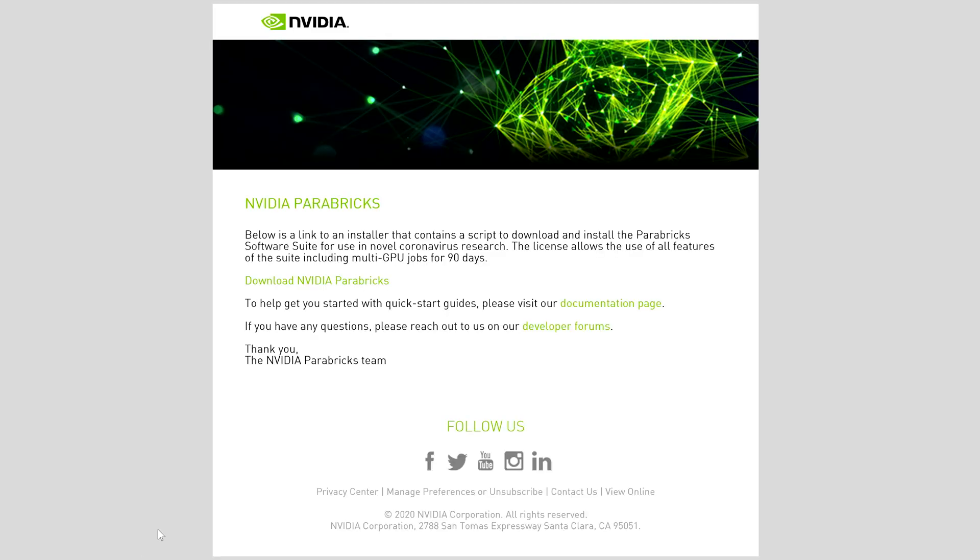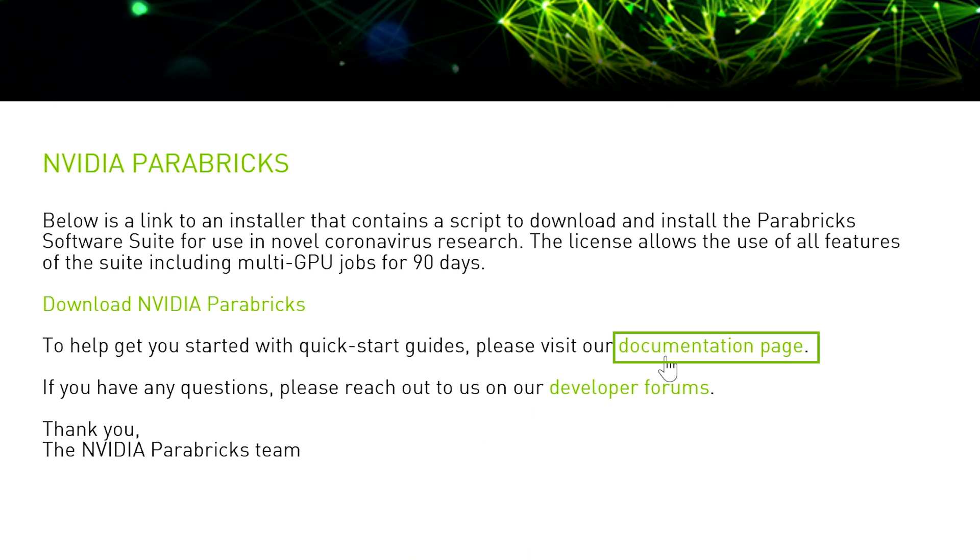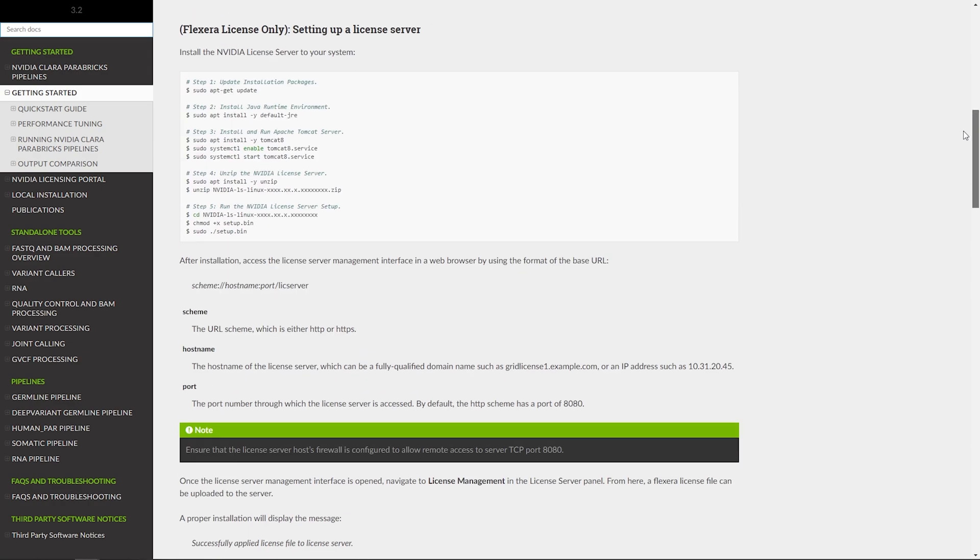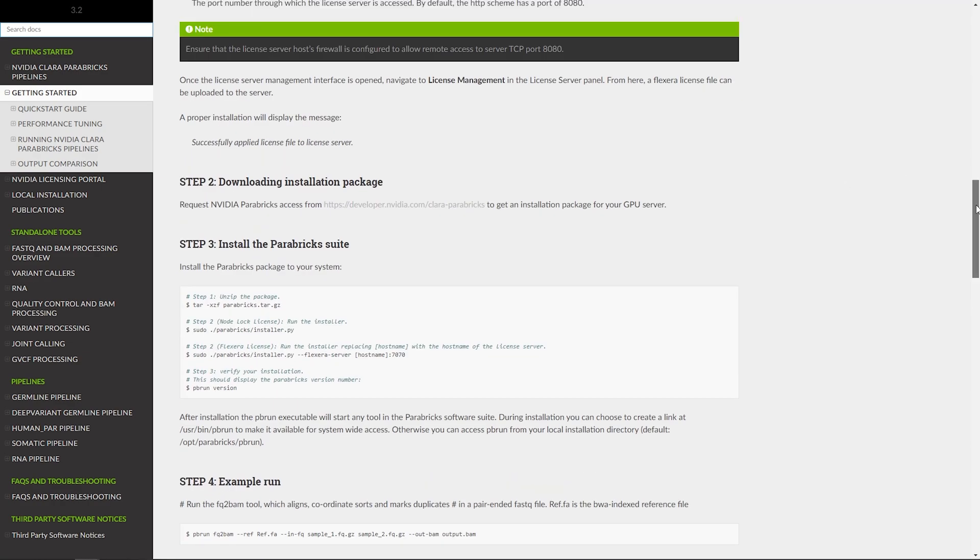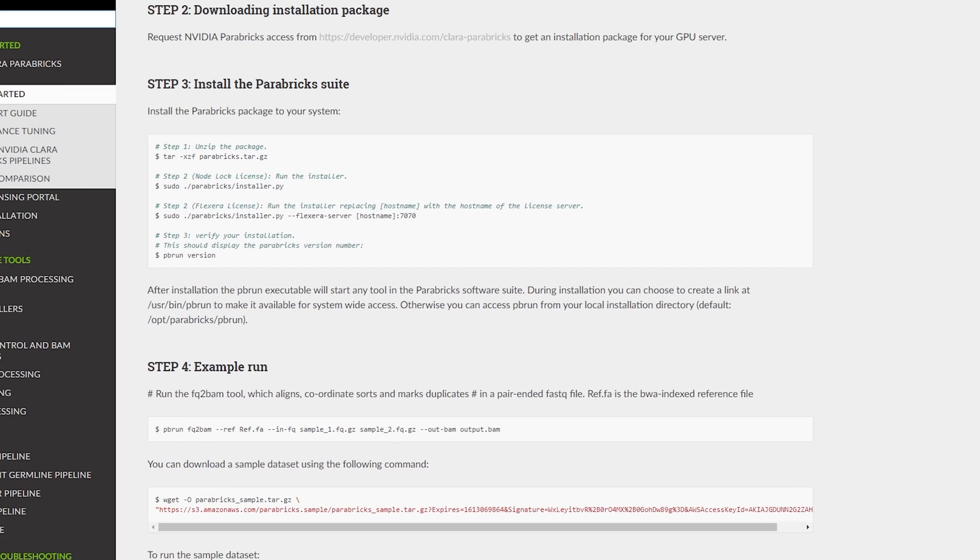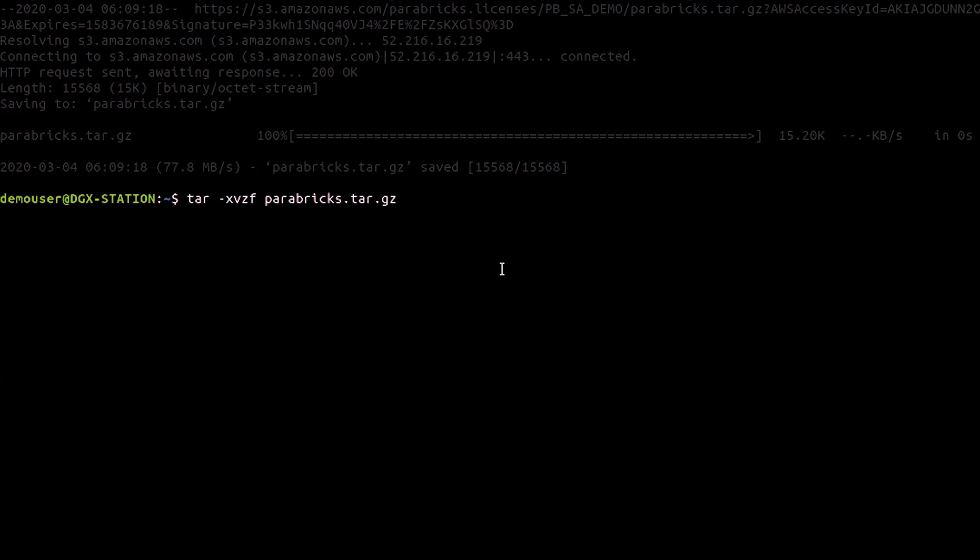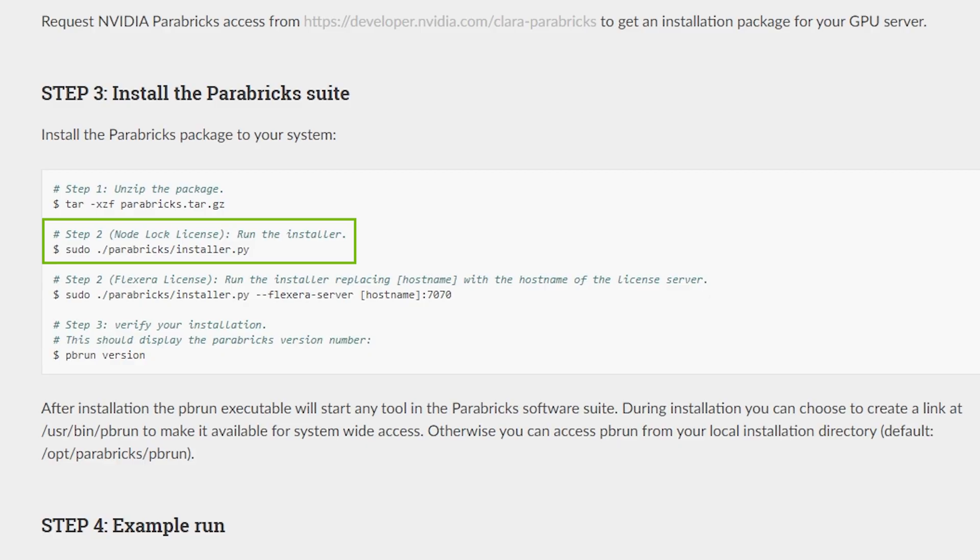To complete the installation of the Parabricks software suite, click on the documentation link received in the email. Navigate to the Quick Start Guide in the left-hand column and complete step 3. First, unzip the package. Second, run the installer.